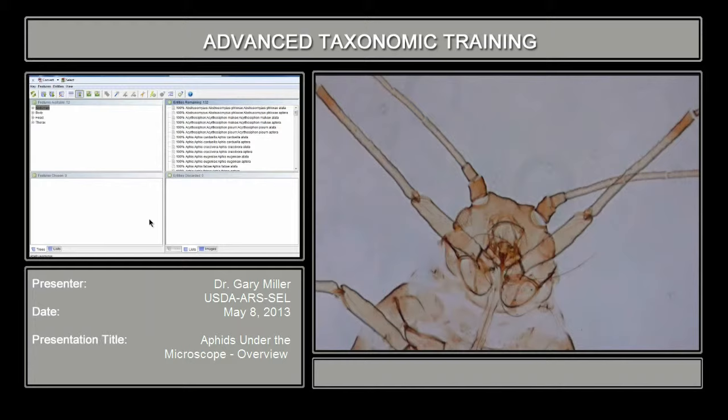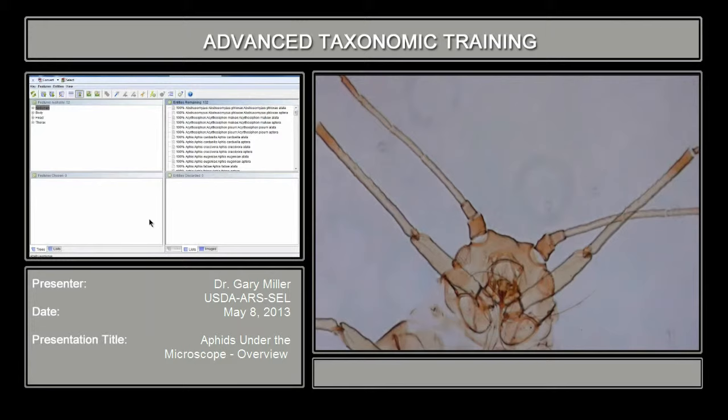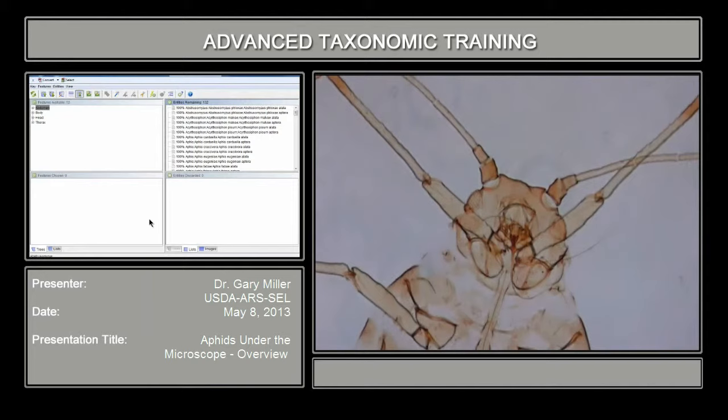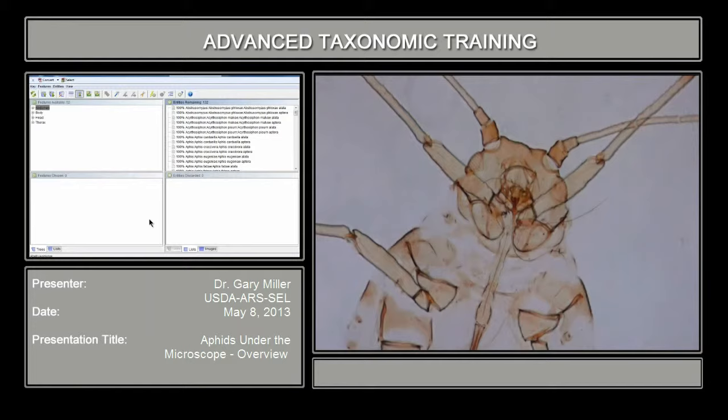Preliminary IDs can be made through a dissecting scope, but as we have here on the screen, this is a specimen — this is Aphis gossypii — and what I wanted to do was show you some structures on this aphid that are going to be critical, not only in a lucid key, which we're going to go through in just a few minutes, but also through a traditional paper key.